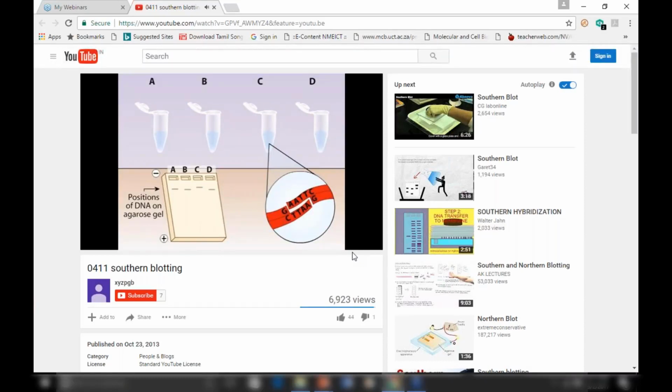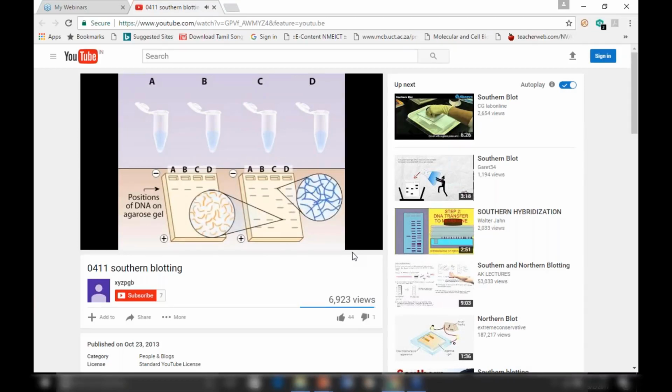If the plasmids in the different tubes are identical in sequence, they should have the same number of EcoR1 recognition sequences. The type of plasmid in this particular sample can be cut in 4 places with EcoR1, producing 4 fragments of different sizes, represented here as different colors. When the fragments are loaded on a gel and electrophoresed, the fragments separate from each other. The slower bands on the gel contain larger fragments, and the faster bands contain smaller fragments.